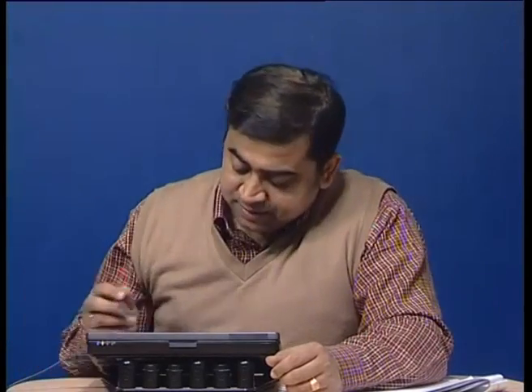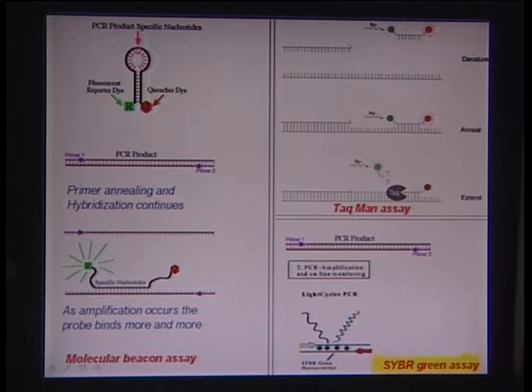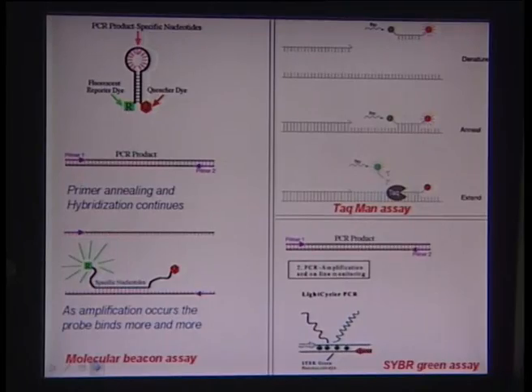The basic operating principle is very simple. It works on the principle of intercalation. I explained last time what intercalation really means. If you have a DNA structure which is more like a cage-like form, with two helical strands of DNA with different base pairs, this fluorophore molecule goes and sits in it without covalently bonding into this cage-like structure, and this results in a change in the orbital configuration and attains an overall state where fluorescence is possible.